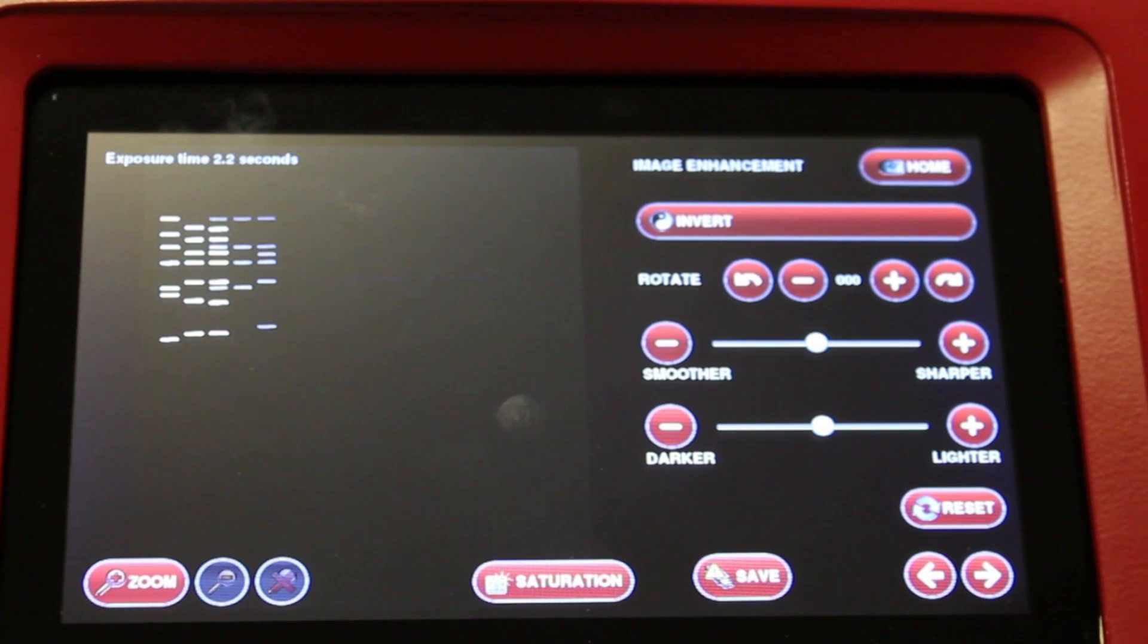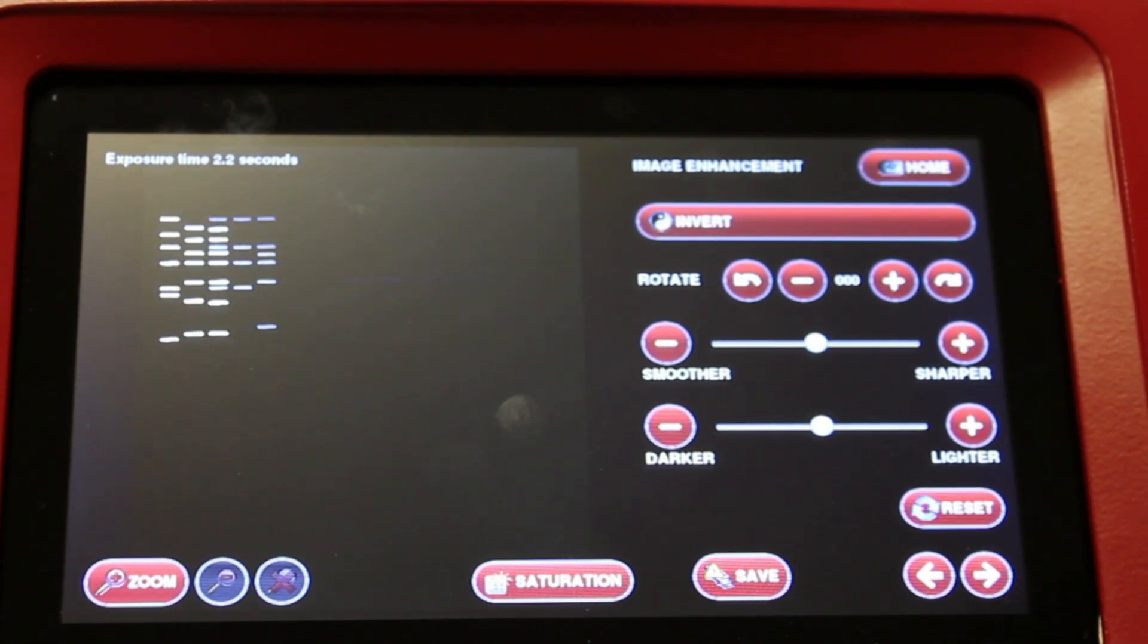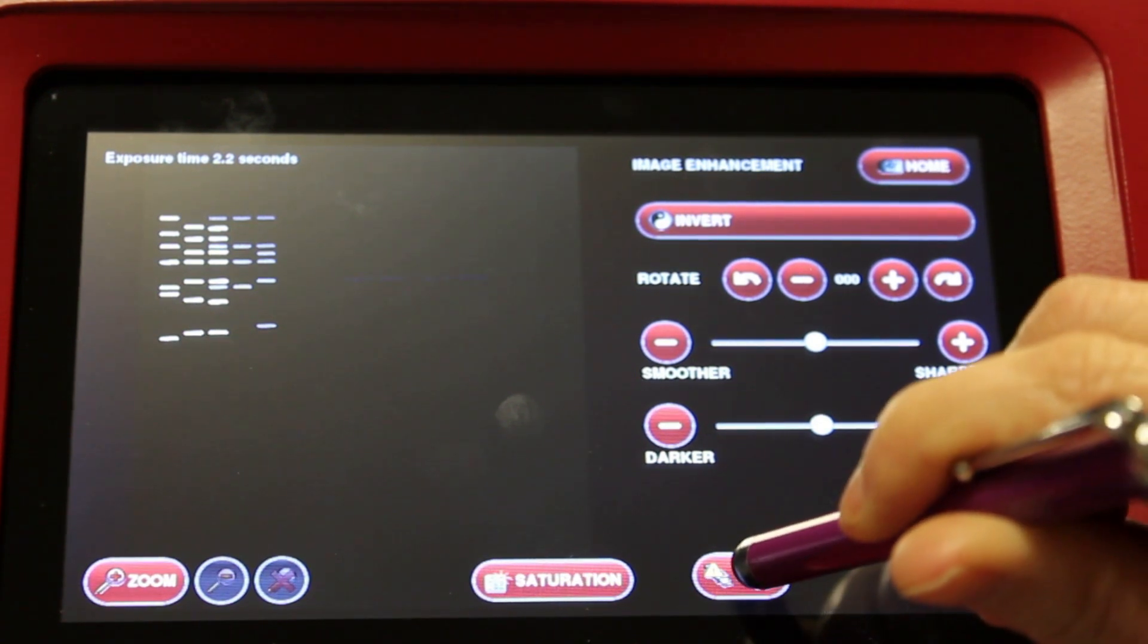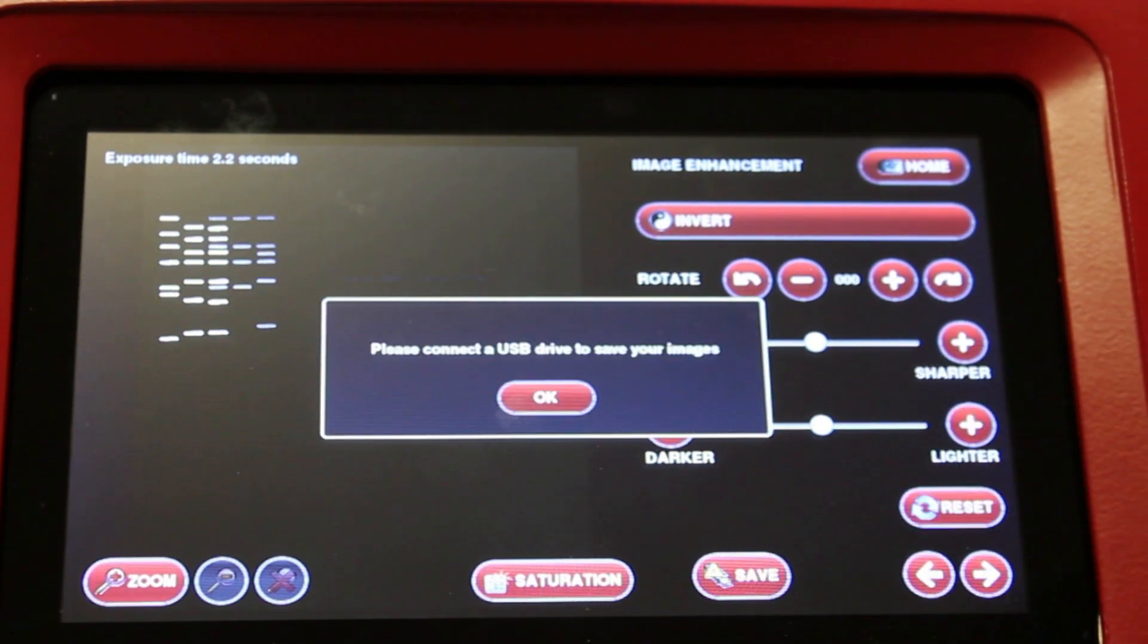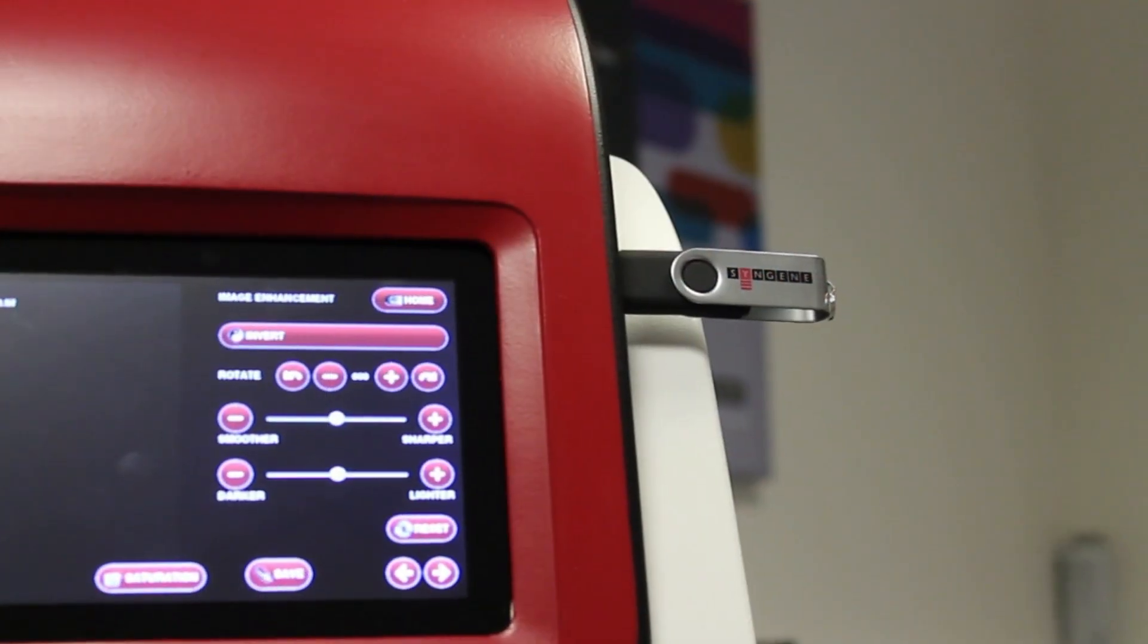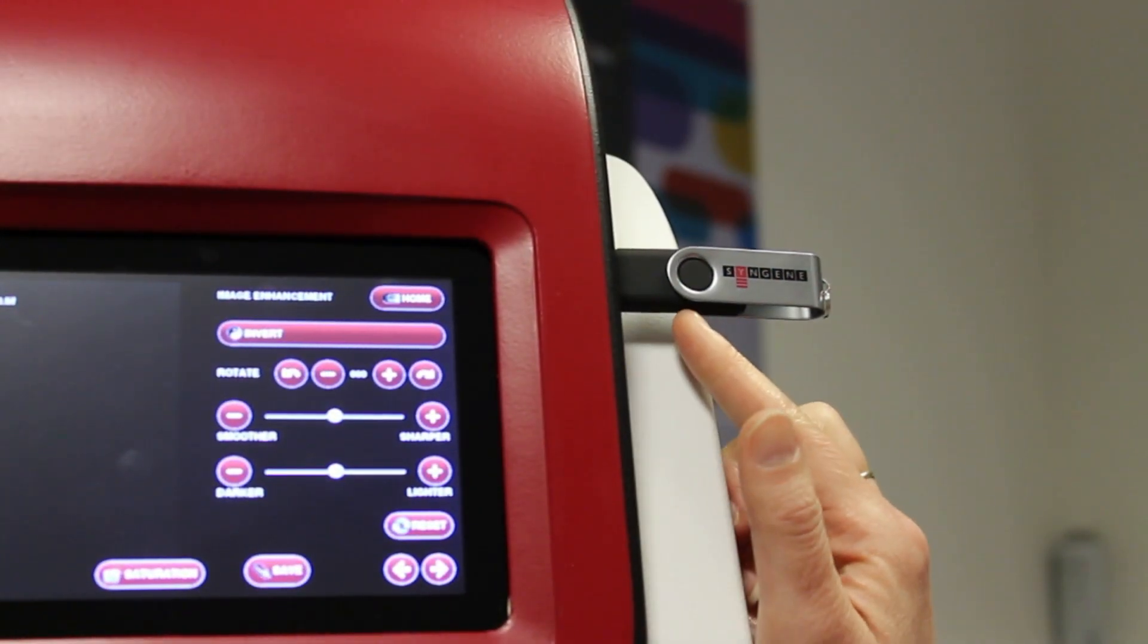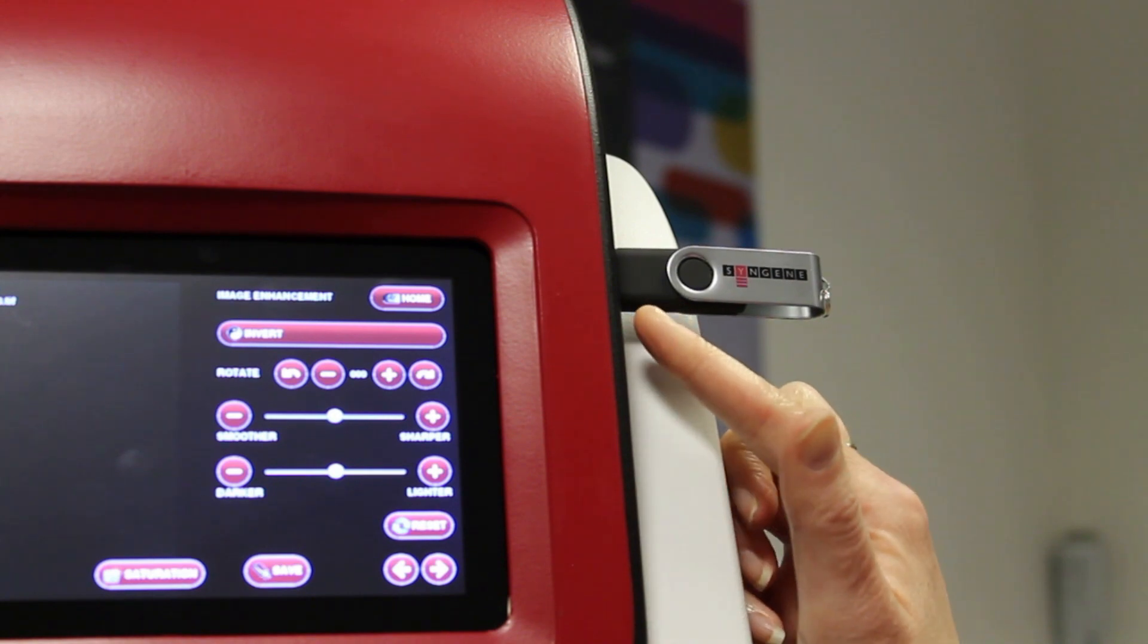Once it captures your image, you can save it onto a USB stick. You can save it as a TIFF or a JPEG file. Just press the save button here. To save your image to a USB stick, just plug in your USB stick here.